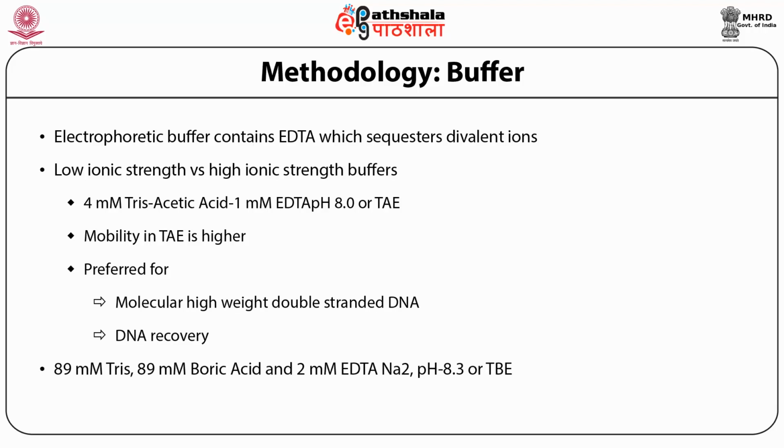The other buffer, which is commonly used, is referred as tris-borate EDTA of pH 8.3, and in short it is called TBE buffer. It is comprised of 89 millimolar tris, 89 millimolar boric acid, and 2 millimolar EDTA sodium salt. Ionic strength of TBE buffer is higher than TAE buffer.